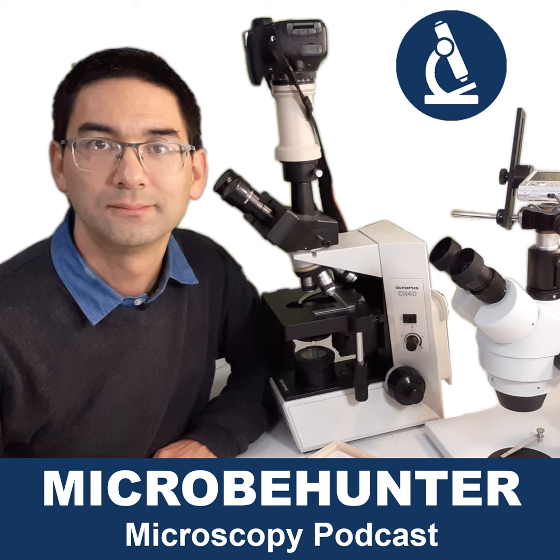So always turn down the microscope lamp. Also prevents some eye damage if you have a very strong microscope lamp, and it goes from 0 all the way to maximum, and then you're blinded. So I would say that make sure that the lamp setting is always low. Yeah, so basically I'm down to problem number 1. So these were 10 issues that I sometimes find when people are not quite familiar with microscopes yet.